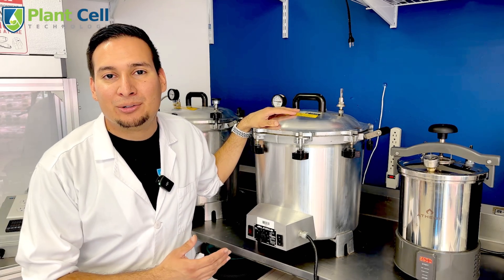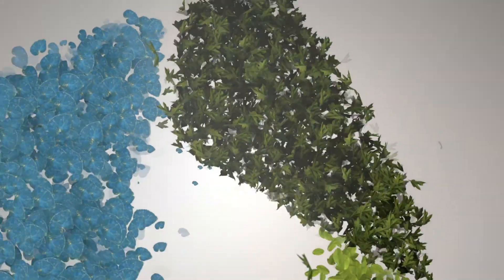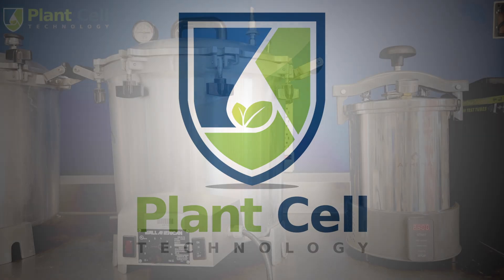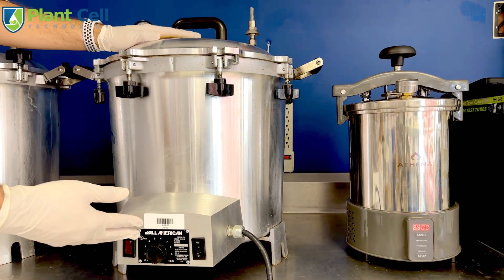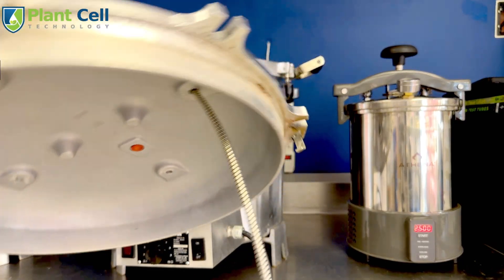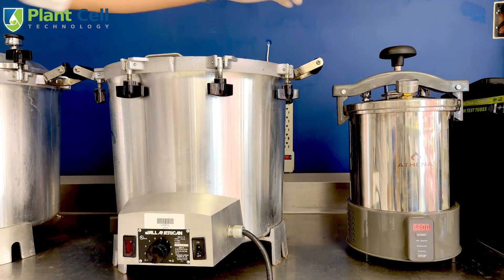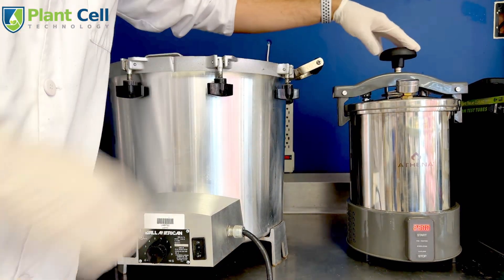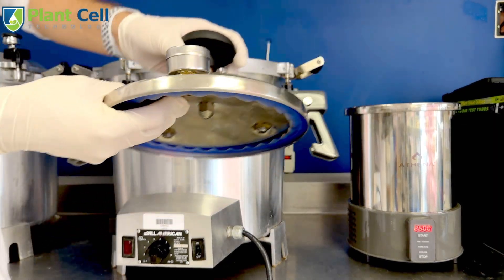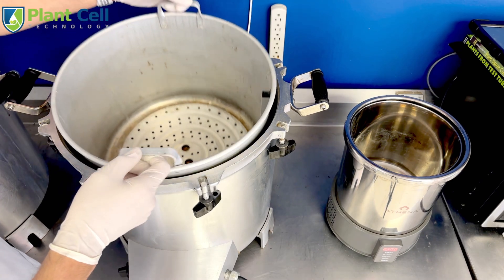Let me show you how to properly use a pressure sterilizer to make plant tissue culture media. Here are the two types of sterilizers I use in the lab. However, the method I'm going to show you applies to all styles of pressure cookers and to newer electric pressure cookers like Instant Pots. The big one is an All-American — it is 39 liters and it's a very popular sterilizer for tissue culture and for mushrooms.